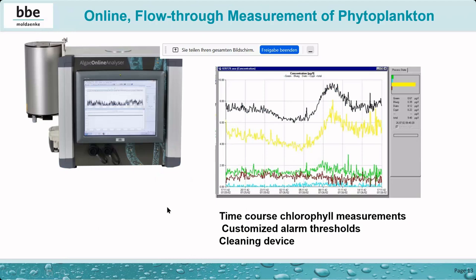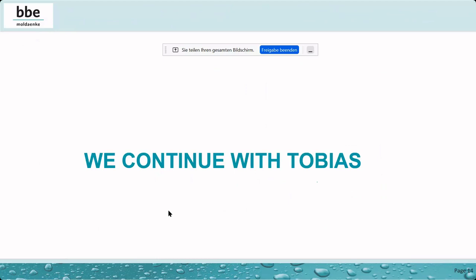So I think this is all for the intro of the chlorophyll measurement with the Algae online analyzer. And now I want to pass this over to Tobias, because he wants to come to the second part.